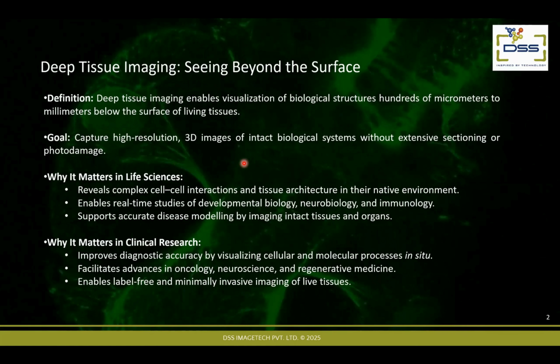And using this, for example, if we are studying a gene, and if we mutate that gene, we can see how cells interact with each other, what defects we see in that, and how this translates into the broader developmental defects within a tissue or an organ. That is what we can study with a multiphoton microscope.